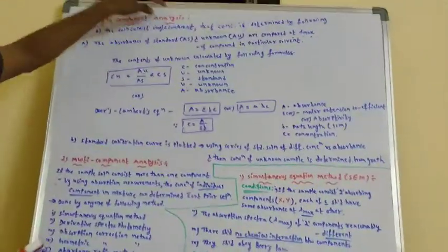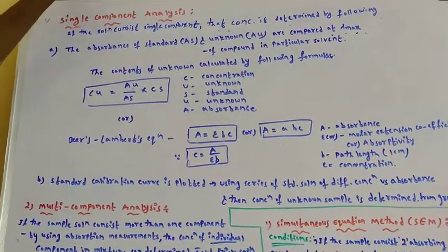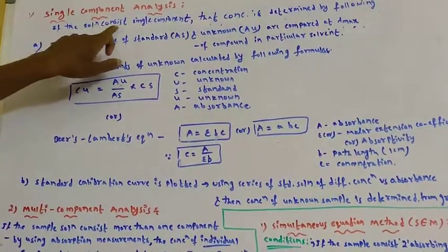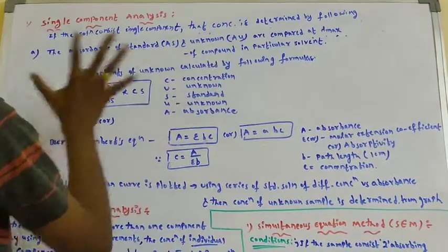Single component analysis. The name itself indicates that the solution consists of a single component, only one component. Another name is one component analysis. If the solution consists of a single component, that concentration is determined in the following ways.